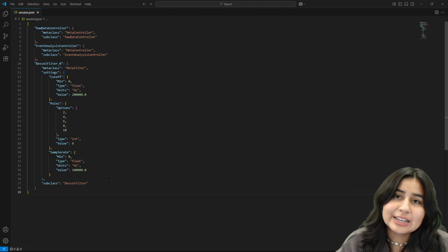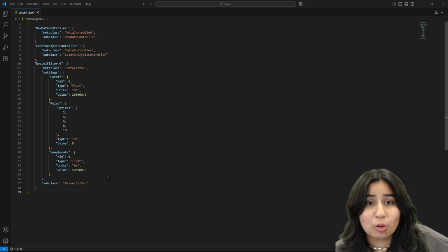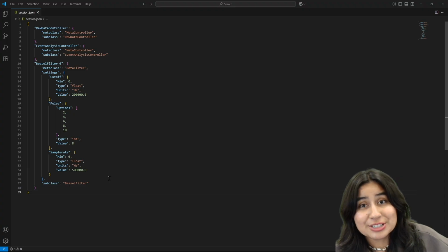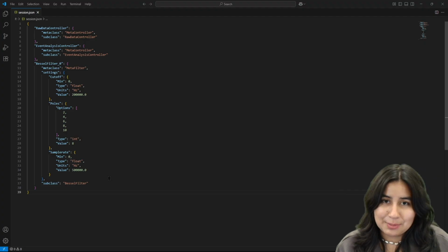And finally, really important to just save as you progress through the different milestones, so that whatever was to happen, you have a backup of your steps, and save progressively your different analysis pipelines so you can refer to them at any point.